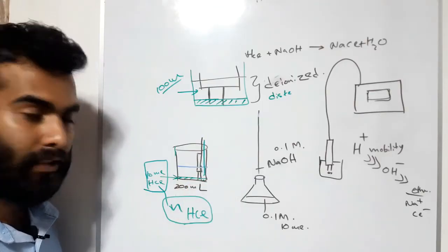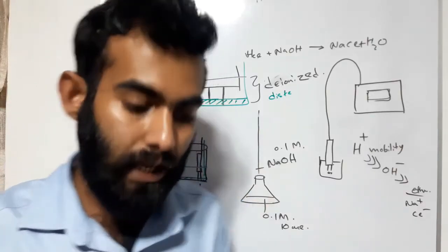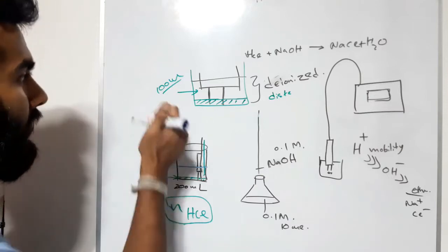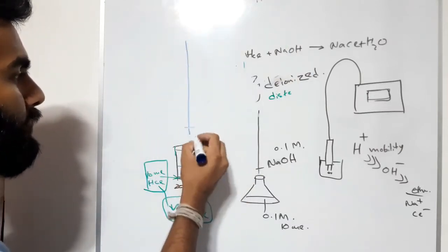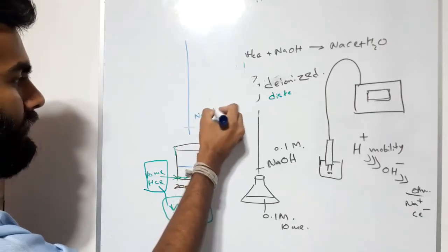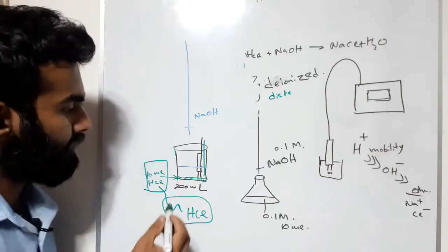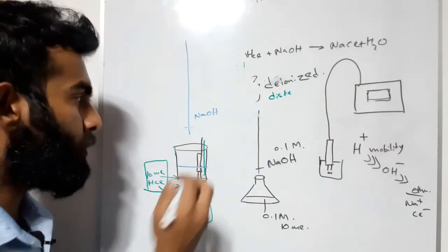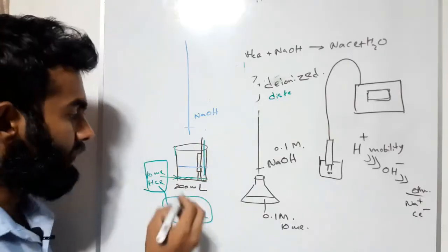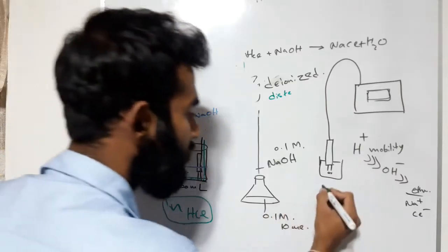However, we have to stir this solution very well during this titration. Now we are adding sodium hydroxide, NaOH, from the burette. When we add 1 ml portions, because initially we have to read the conductance of HCl, we will plot a graph.